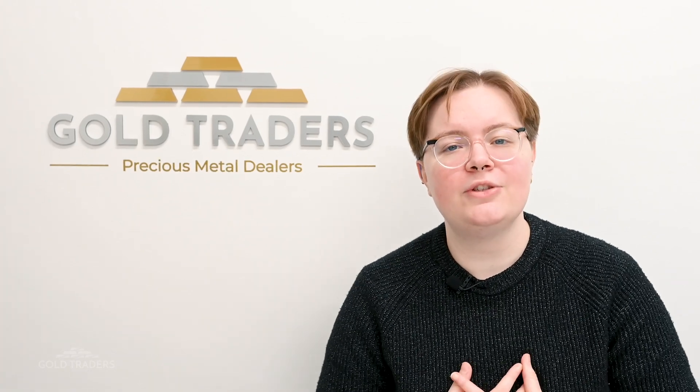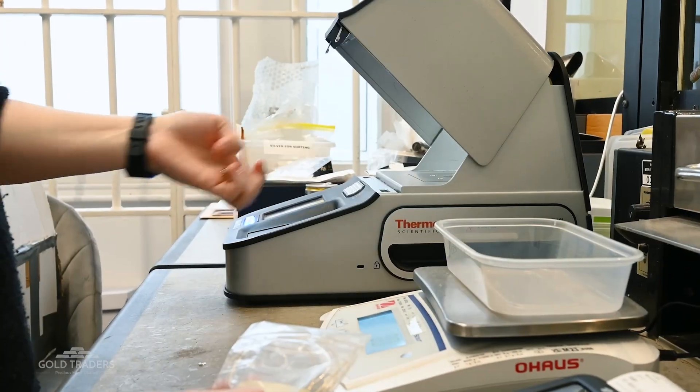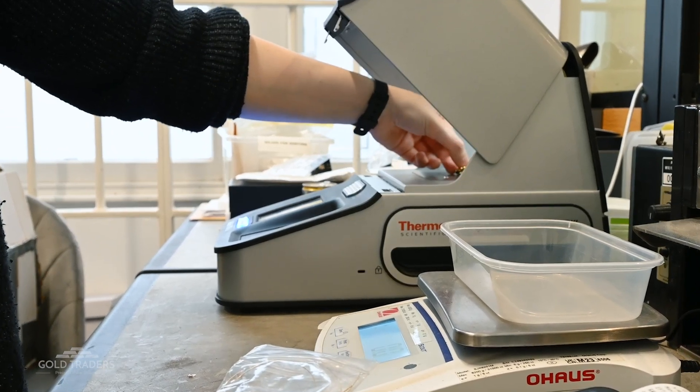Here at Gold Traders we utilize XRF for our own testing, so let's head somewhere a little bit different to talk about that a bit more. I am now in the Gold Traders gold counter, which is our base of operations and where we do all of our day-to-day trading. I'm currently sat with our XRF machine, which is the Niton DXL, and this XRF machine is designed specifically for precious metals.